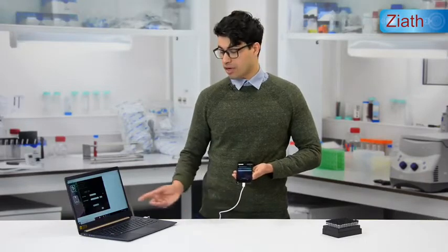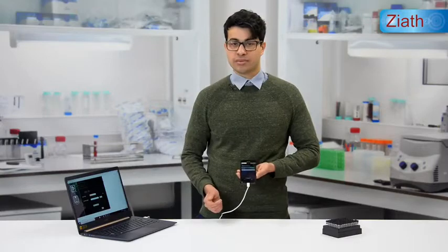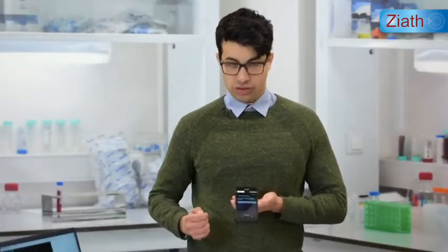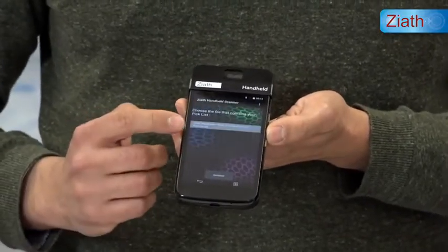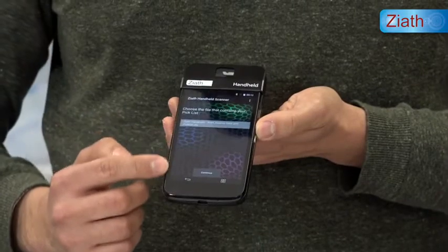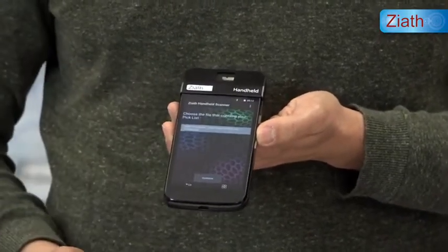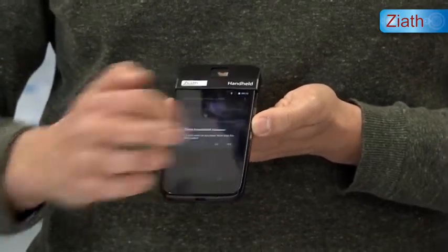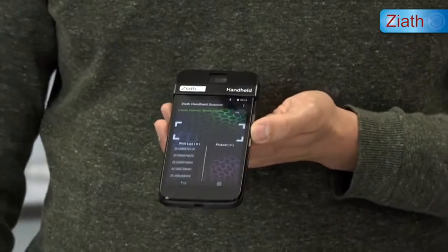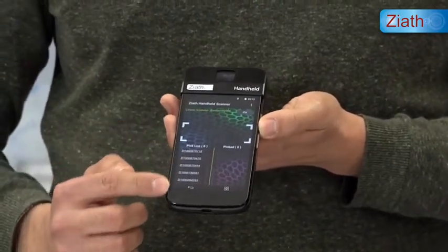To use the handheld client again, you must be connected to the computer via the micro USB cable. The file that we placed onto the handheld from the handheld client can be seen here. You can store multiple files onto the handheld, which will be shown in a list. We can then click on the file that we wish to open, click Continue, click No to give a fresh read state. The list of tubes that need to be collected will be displayed on the left-hand side.